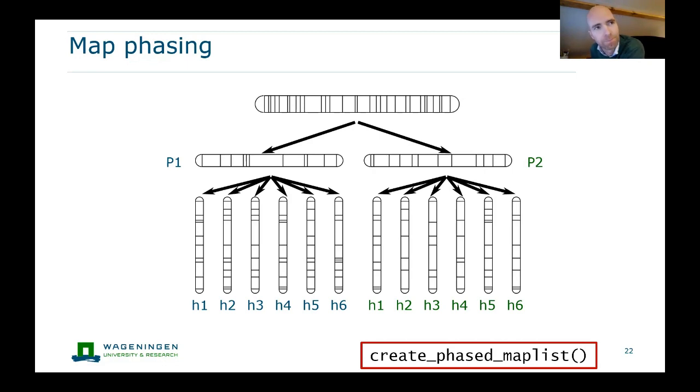It is, I would say, a weak point of the whole process if you don't have sufficient simplex nulplex markers. What I often say, if that's the case, and if you're working in a diploid or a tetraploid, just use polyorigin. It does a fantastic job to rephase. So you can use polymapper to create your map to give an order, and then just use polyorigin. If you're working in a hexaploid, unfortunately, you'll either have to use MAPpoly or just put up with polymapper's phasing, because polyorigin hasn't been extended yet for hexaploids, but it may well be in the future.